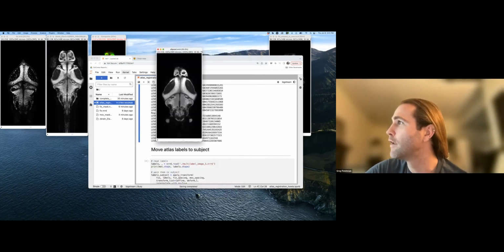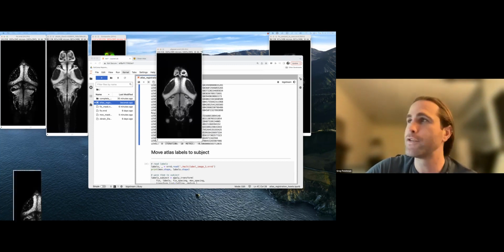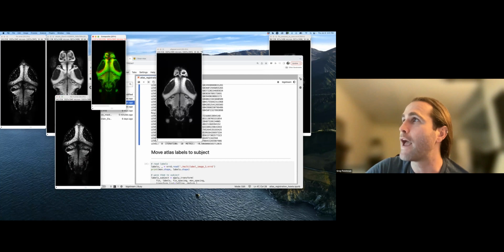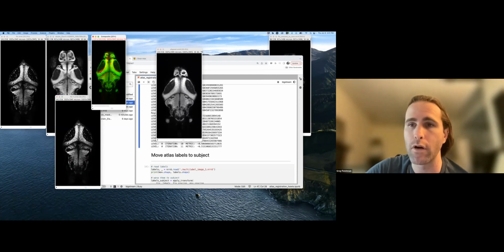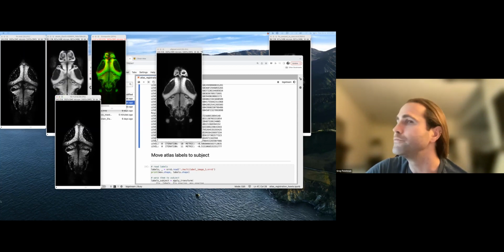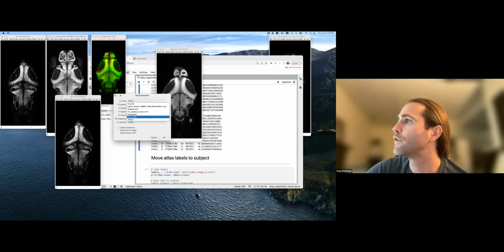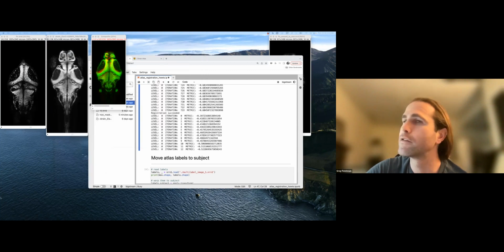This is aligned. This is the result of applying both the affine alignment and the deformable alignment. So now I'm going to put this on top of the fixed image data, and we'll see if we were able to correct those areas in the affine only alignment that were still incorrect. Okay, red fixed image, green aligned image.